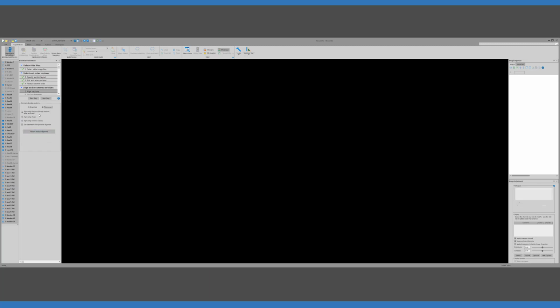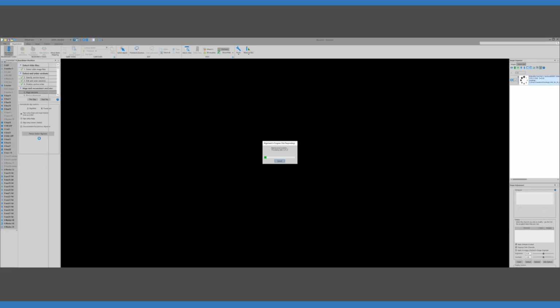And so this step aligns those sections, starting at the beginning and going all the way through the series. I'm going to start that using the top version. And Brian, who again has written this software of how to do this, is going to describe what's going on. Sure. So what's happening right now is we're using a procedure called image registration to align each section in the series to the preceding section in the series.